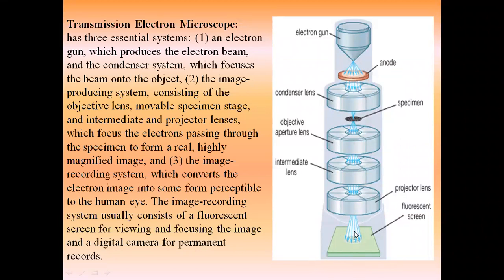The electrons coming onto the screen, if it is not the fluorescent screen, can be on a CCD screen. That will transfer the information from the CCD to the CPU of the monitor, and finally it will amplify and recreate the image captured on the CCD. That is ultimately visible on the screen of the computer. Okay, so that was the first portion I discussed.